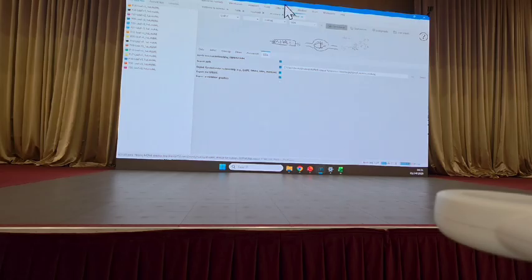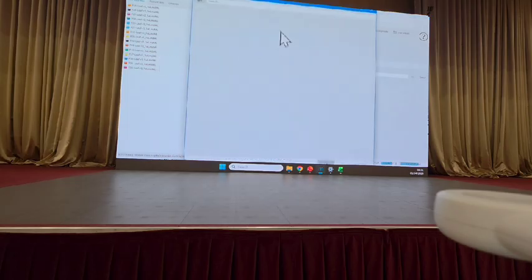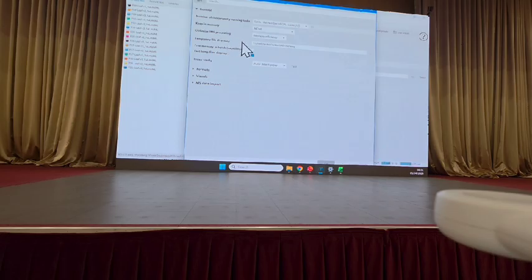One thing I forgot to mention, I am very sorry. If you didn't select a location in set preferences, there is a temporary file directory. If you didn't set that, it might be a bit slower in the data processing. I'm sorry, I forgot to mention that in the beginning. Usually when you set this, do it somewhere local on your computer. If you set this somewhere like on a cloud, it can become buggy, maybe crash the software, because it's trying to upload temporary files to the cloud and it's taking way too long.